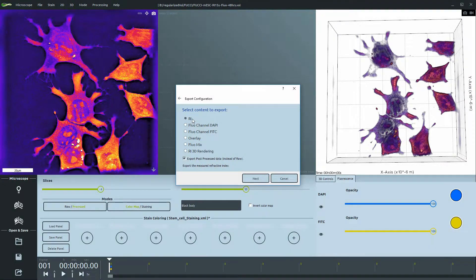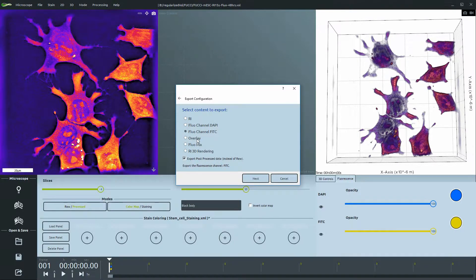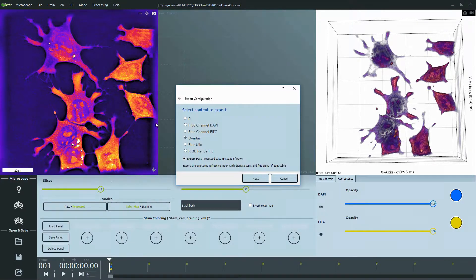You are then prompted to choose which content you would like to export: the refractive index values, the individual fluorescence channels, an overlay of the refractive index with a digital staining, a color map, a fluorescent signal — basically anything that is visualized in the 2D view on the left.